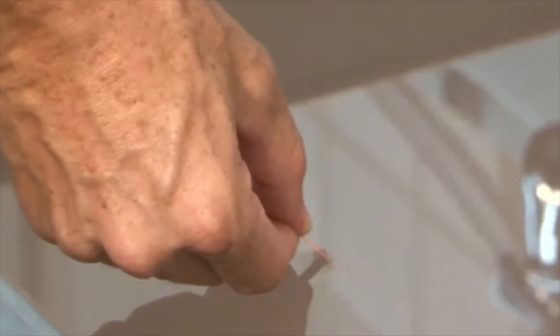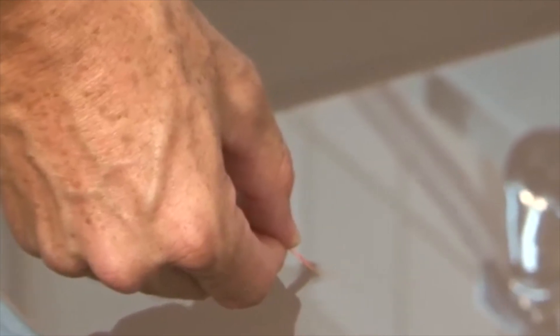Tear off about two inches of test paper and dip the strip into room temperature sanitizing solution. Hold steady for ten seconds, no stirring.